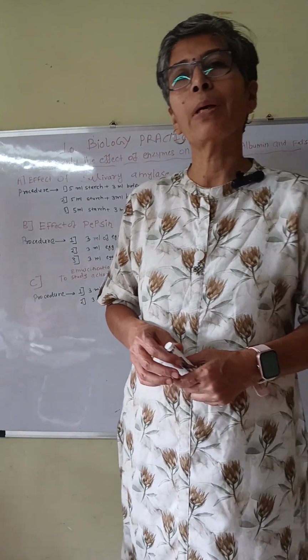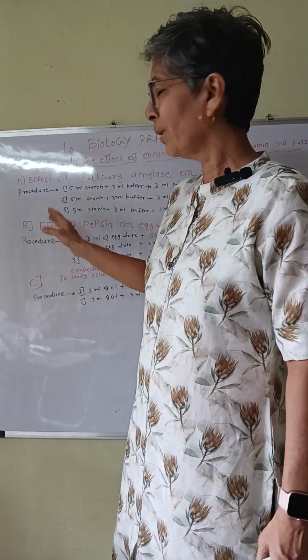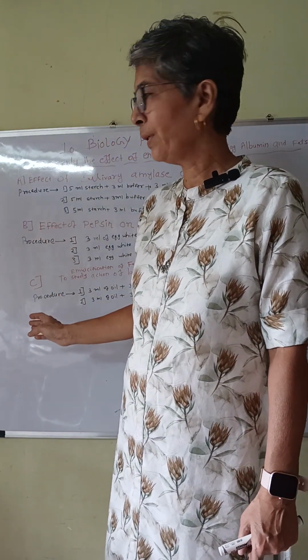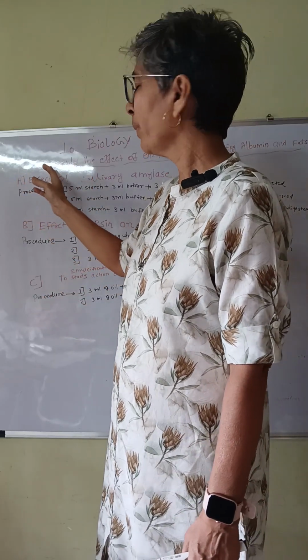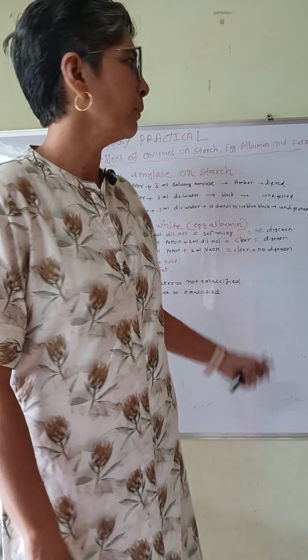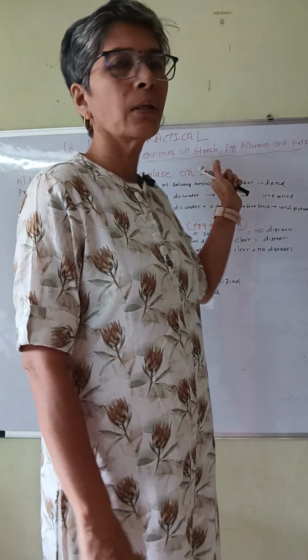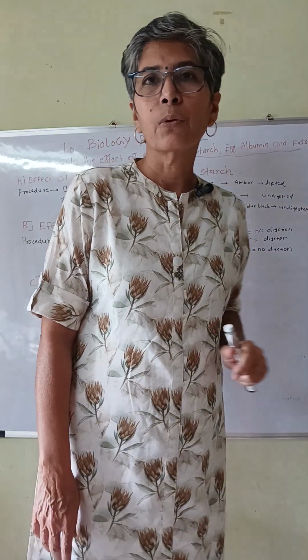This is 11 Biology Practical. Today we are studying all these three activities. The main experiment is to study the effect of enzymes on starch, egg albumin and fats.